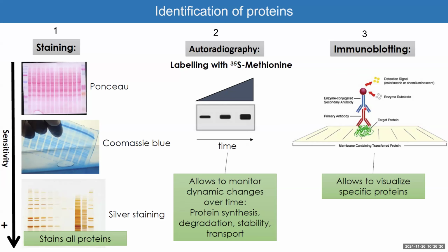I will have to find an antibody that is specific to that protein, which is the target of this study. Then I would incubate my antibody on the membrane for probably overnight or a few hours. And then the primary antibody will find the protein on the membrane.